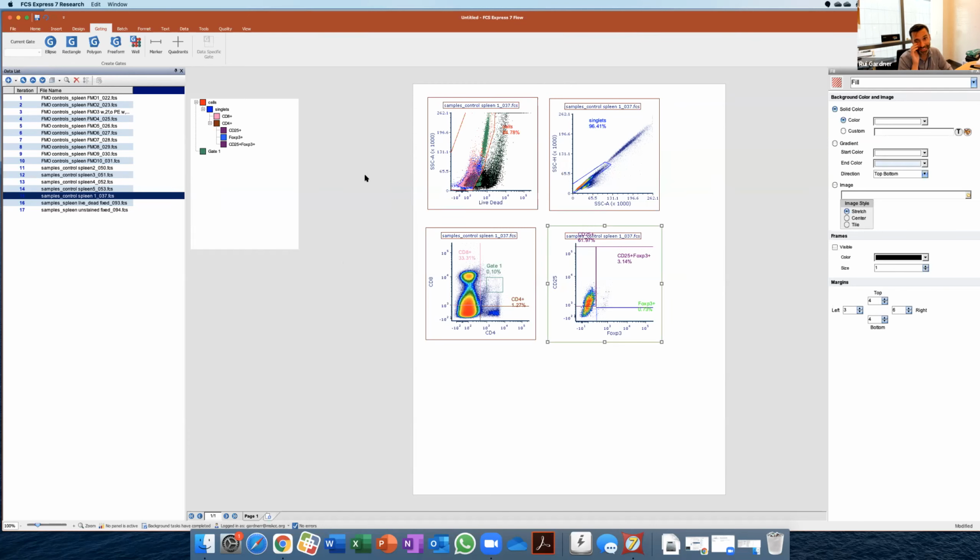Well, what I was going to say, I always say to people, you're in control of your experiment from beginning to end. You can choose how to design the panel, how to run it, how to analyze it, and how to present it. And as we've seen, both FlowJo and FCS Express have different ways of displaying the data. So either histograms or bivariate plots, and there are different types of bivariate plot. And you could use any of those.